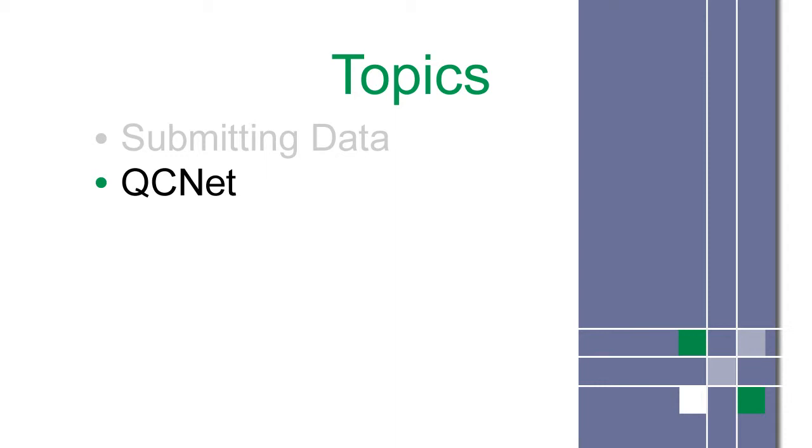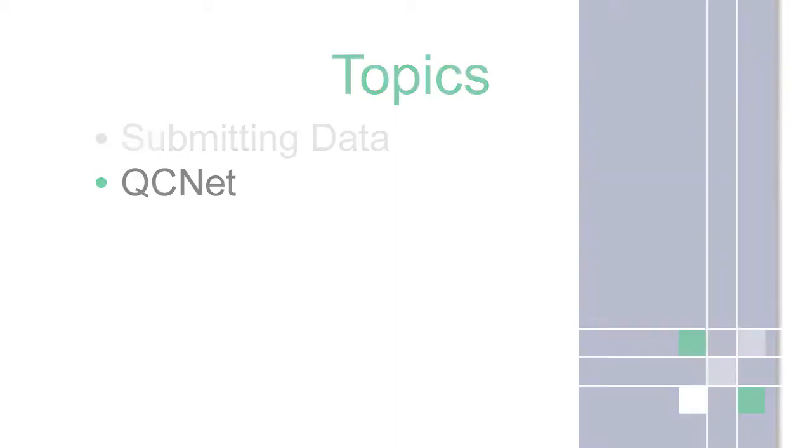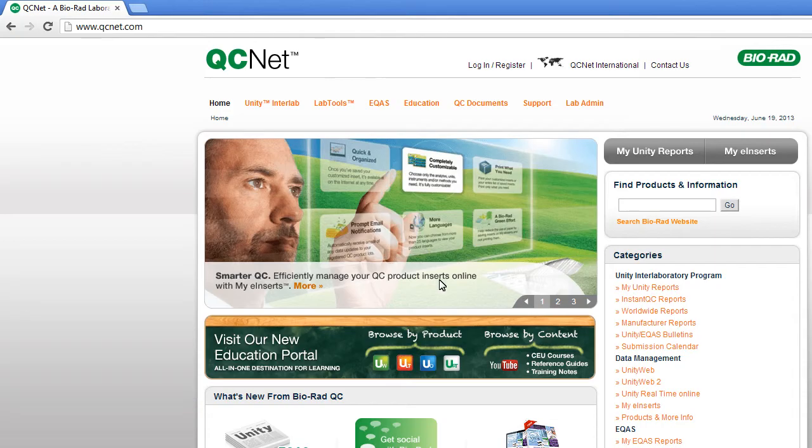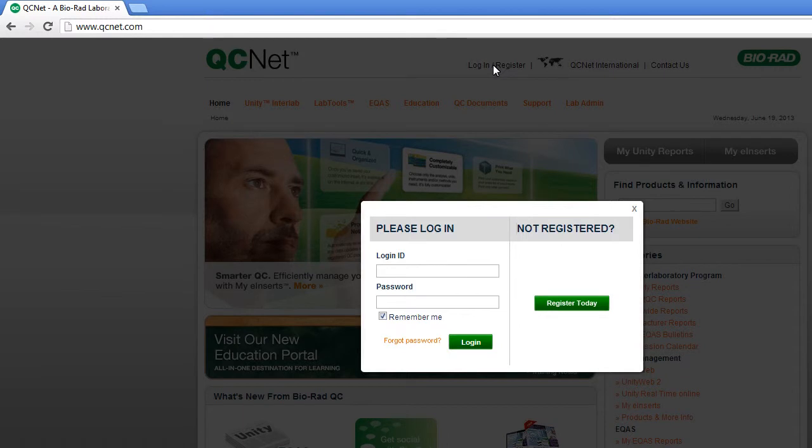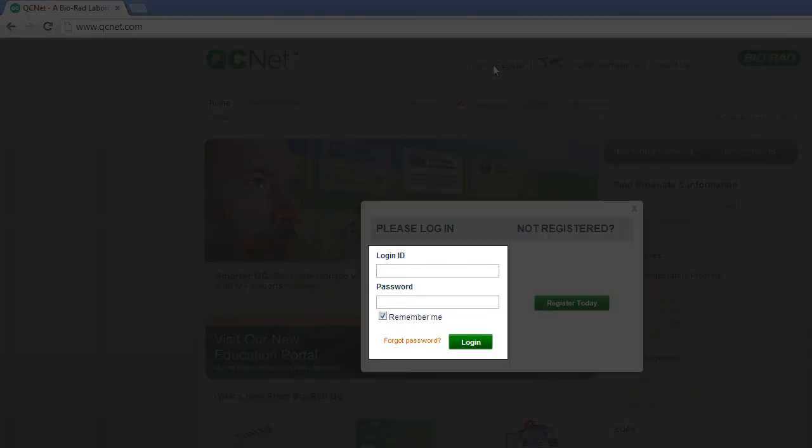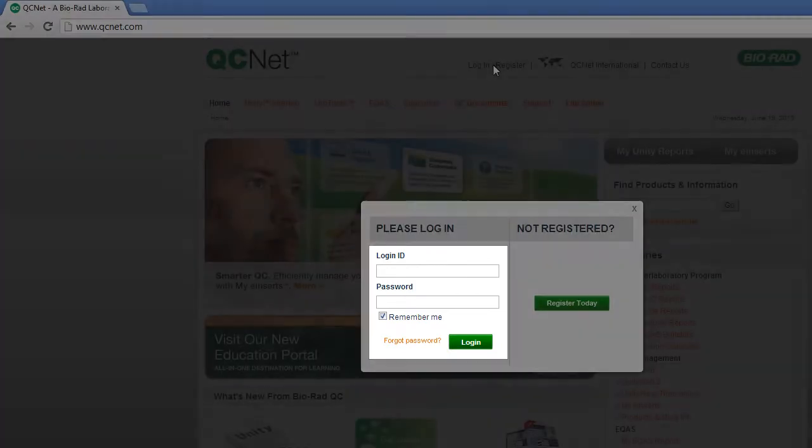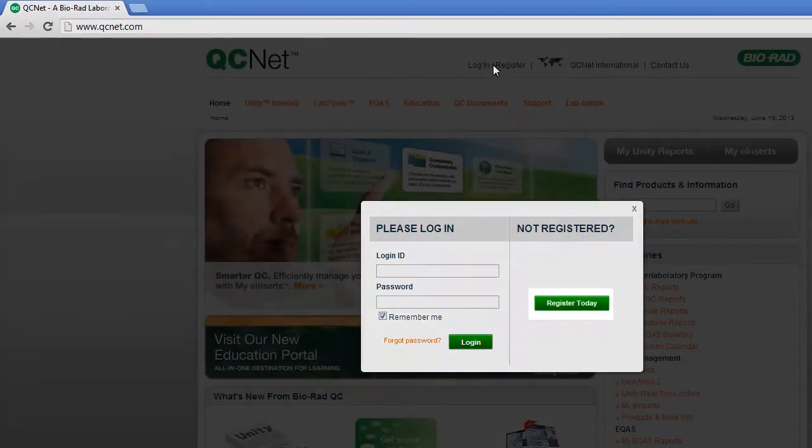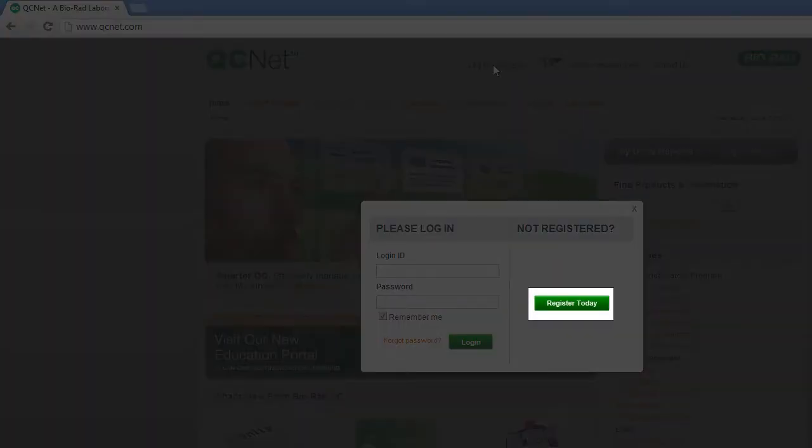First, log on. Existing users enter a login ID and password. New users must register.